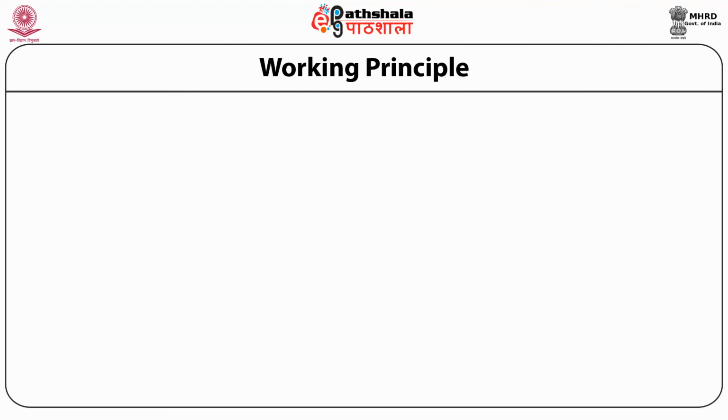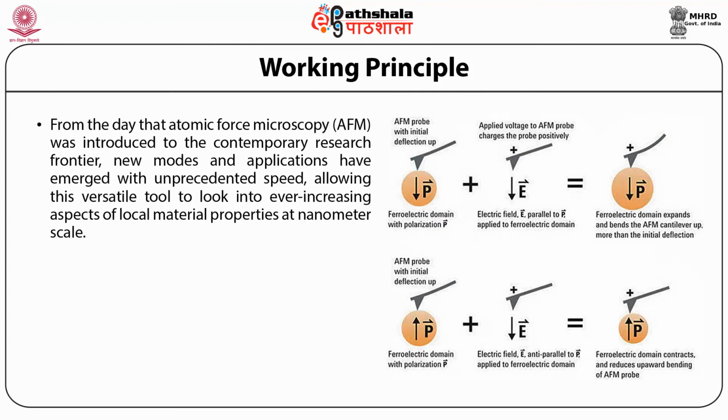Let us now discuss the working principle. From the day that AFM was introduced to the contemporary research frontier, new modes and applications have emerged with unprecedented speed, allowing this versatile tool to look into ever increasing aspects of local material properties at nanometer scale.